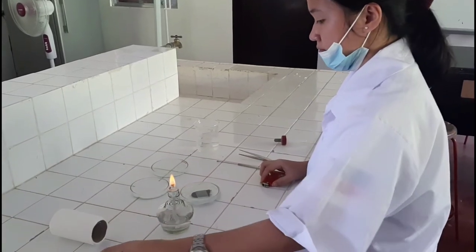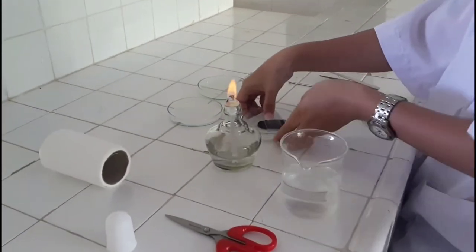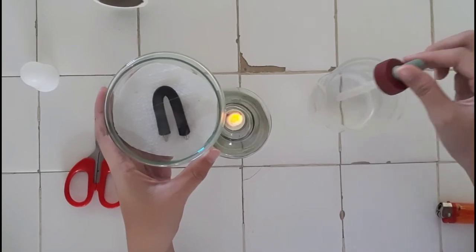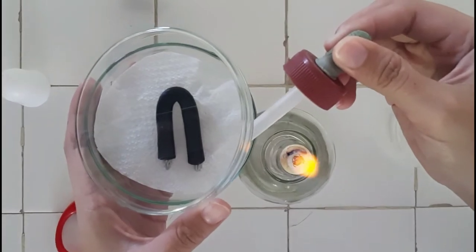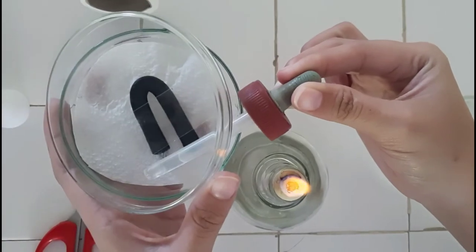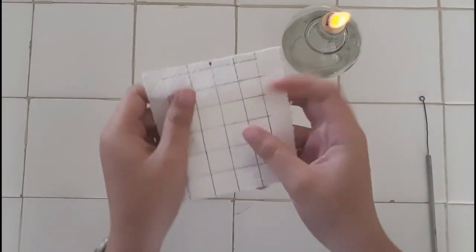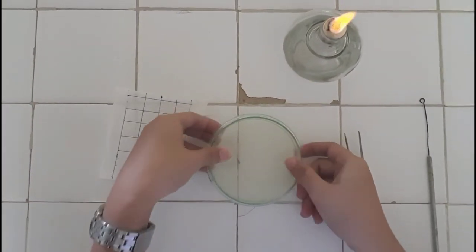After sterilization, using aseptic technique, add distilled water to the tissue paper to keep the slide culture from drying during incubation. It is better to use a 20% solution of glycerol to keep the moisture inside the petri dish. Since it is not available, distilled water is the optional moisture for the agar block. Reflame and set aside.